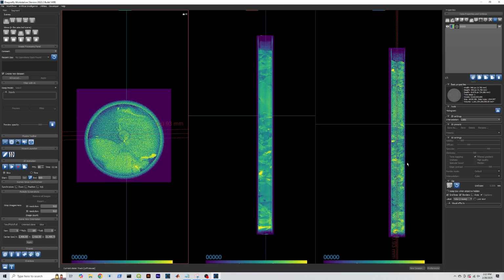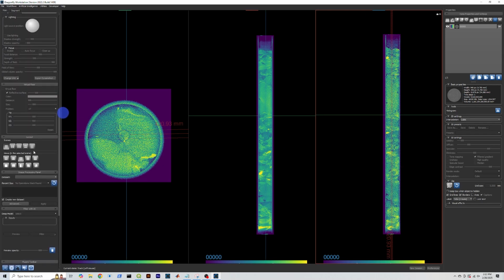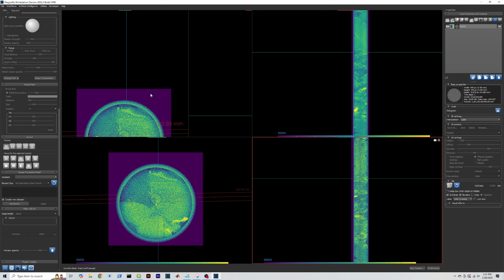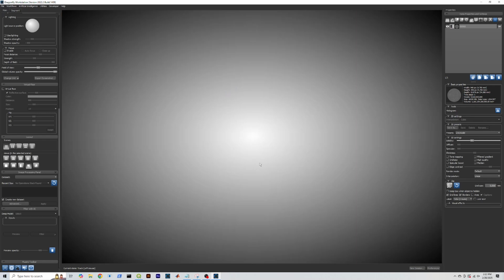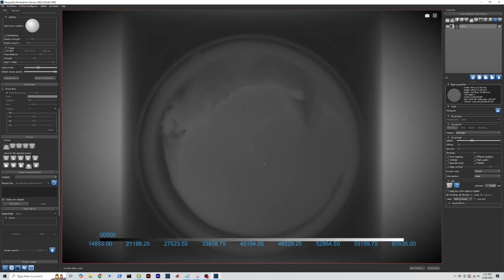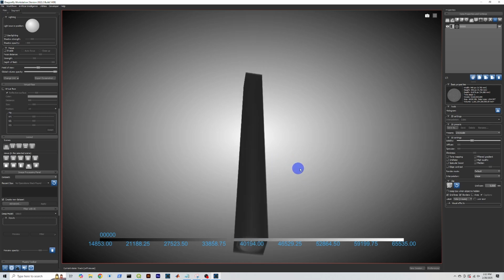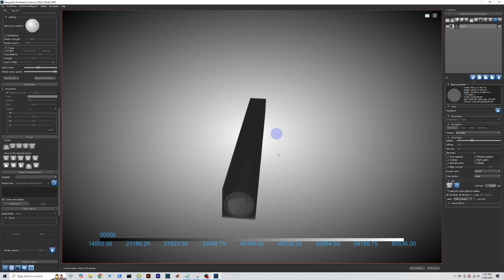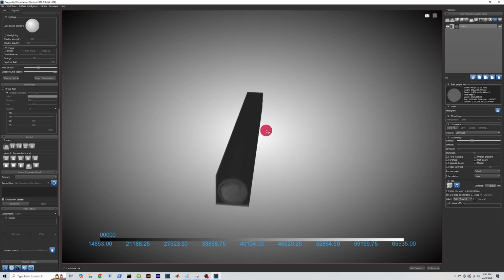And what are we going to do next? Well, first I'll show you what the three-dimensional view actually looks like. If you go to the 4-panel view, the three-dimensional panel will show up. There it is. We can double-click it to enter that view only. And the controls are roughly similar, so if you push your roller ball on your mouse and you push the mouse away from you, you can get that to zoom away. And then if you single-click and drag, you get to orbit that three-dimensional volume, and then I think pan is going to be the same, so it's a right click plus a left click at the same time, and then you drag. Okay, so those are your primary functions there.